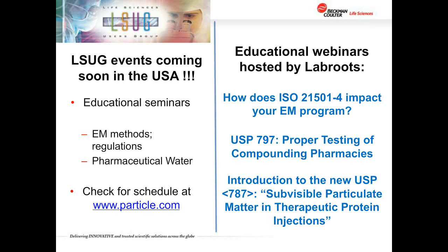But if it's a 21501-4 type test, you're looking for size definition. You're looking for verification of the volume sampled, either by an airflow test plus time, because you're always reporting counts per volume, so you need to verify that. And then you also want to look at your counting efficiency at a couple of different sizes as specified in the document.